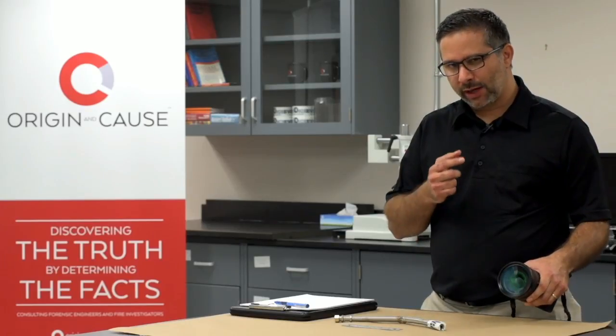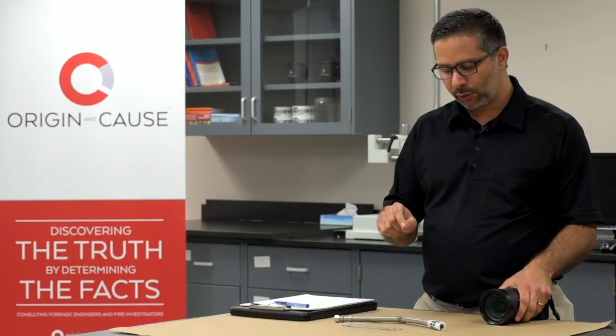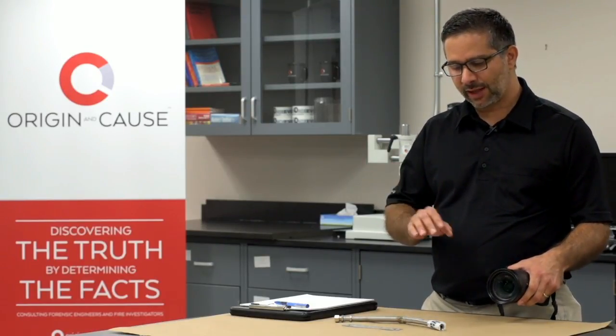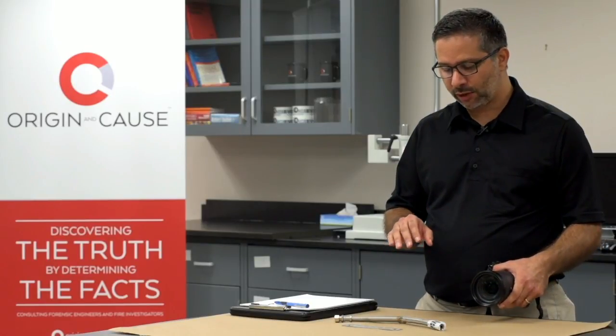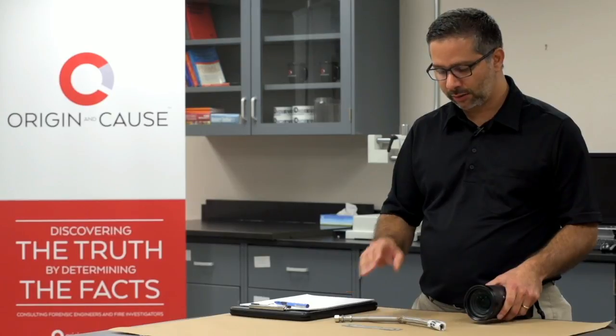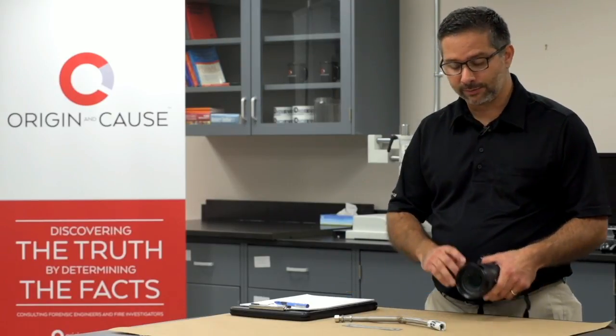The microscope is a great tool to understand how corrosion happens in these braided hoses, but first things first, let's document it, make sure we take some notes, document the manufacturing markings on it. So let's get right to it.